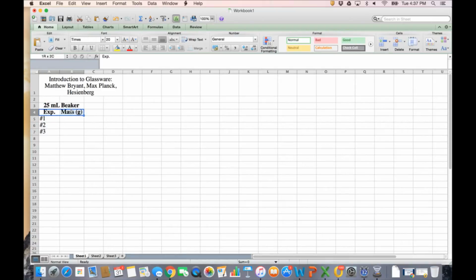I don't necessarily need these bolded. So here I'm going to input my mass in grams, and my mass in grams is 47.38, 47.39, and 47.39.